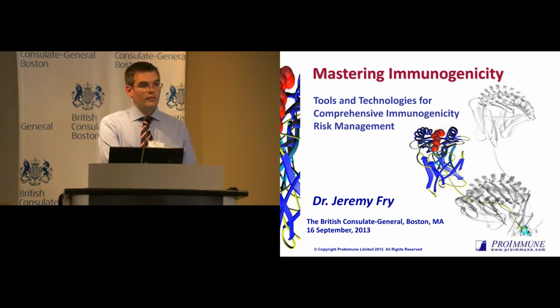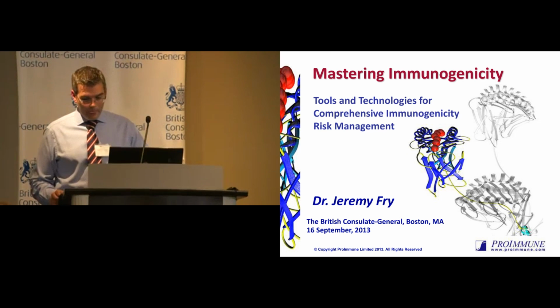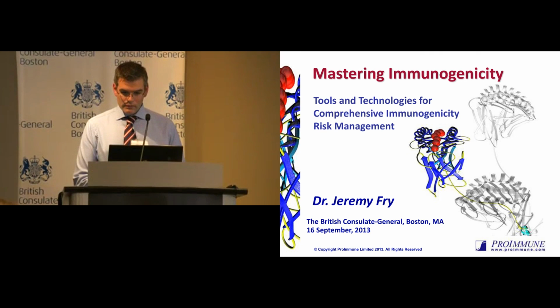And I think we over-egged it a bit. It all crashed out, and in fact it was a bit difficult to measure the protein concentration that was left. So the values there may not be entirely accurate, so it was a bit of a blind addition to the assay. But clearly you see a thresholding at some point as you add more. You see a real kickoff, and you need to remember that this is a logarithmic scale, so the cytokine response is really 100-fold or more.